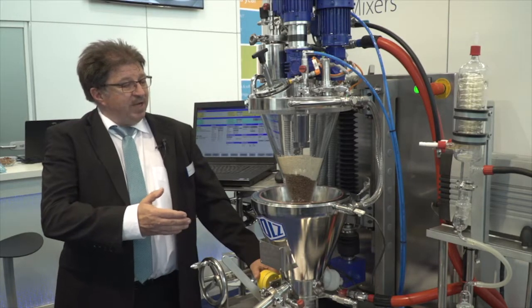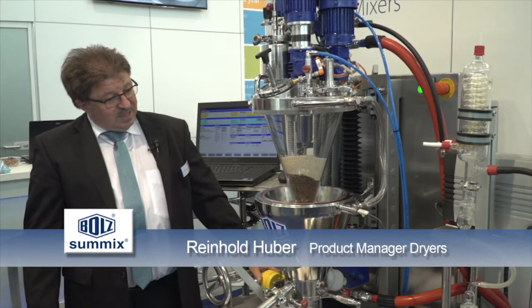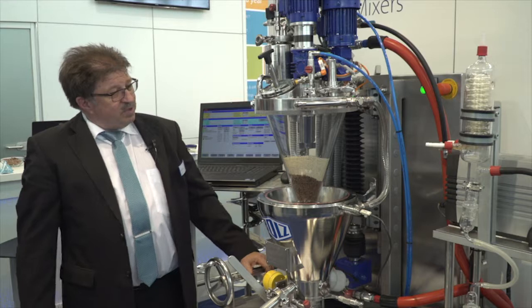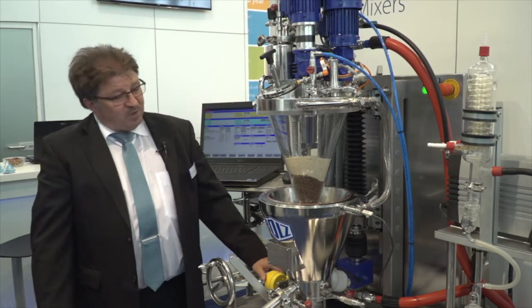What you can see here is possibly the smallest little drying and mixing unit of the world — a complete turnkey system, easy and compact to be installed in a fume hood for testing and research and development of new products.